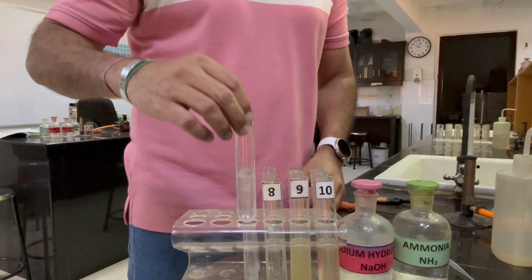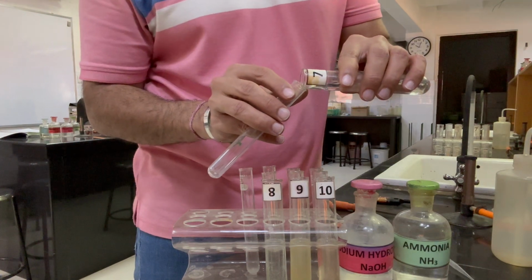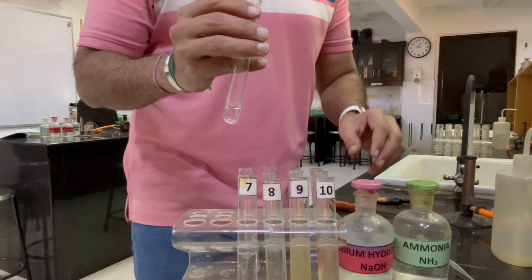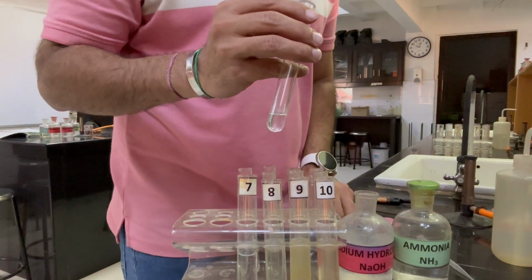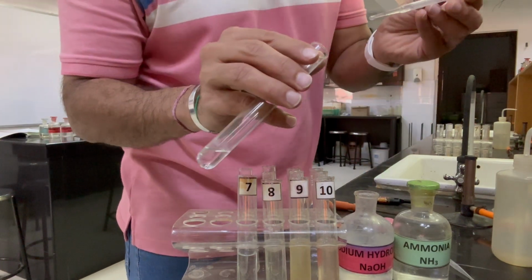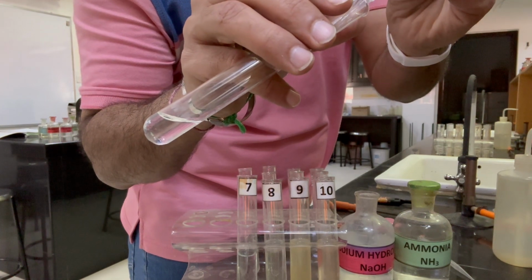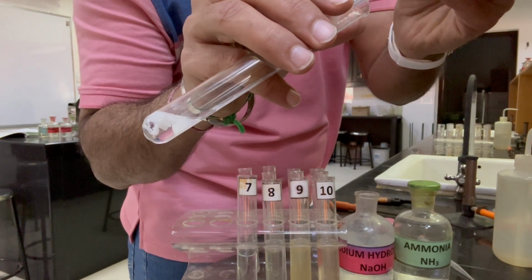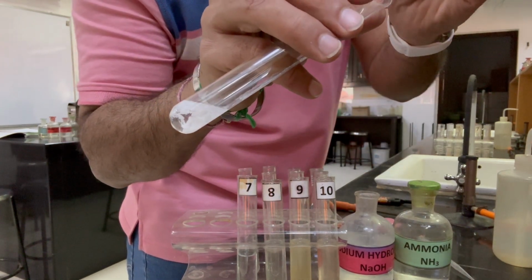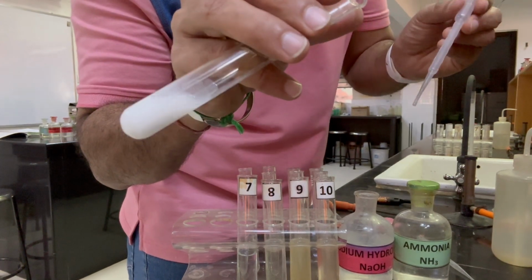Now let's take 1 centimeter depth of FA7 and add a few drops of aqueous sodium hydroxide first. If we add a few drops first, white precipitates are formed, and if we add in excess, those white precipitates are not dissolving.